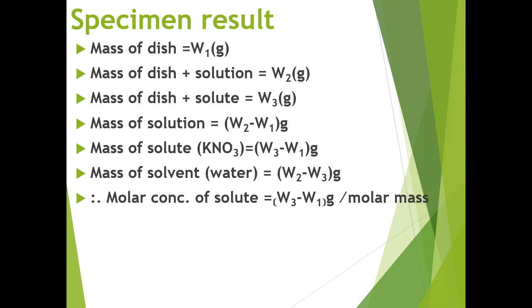Everything is in gram. Therefore, the molar concentration of the solid will be W3 minus W1 in gram divided by the molar mass, and you are going to have another value, which we let be W4 in moles.